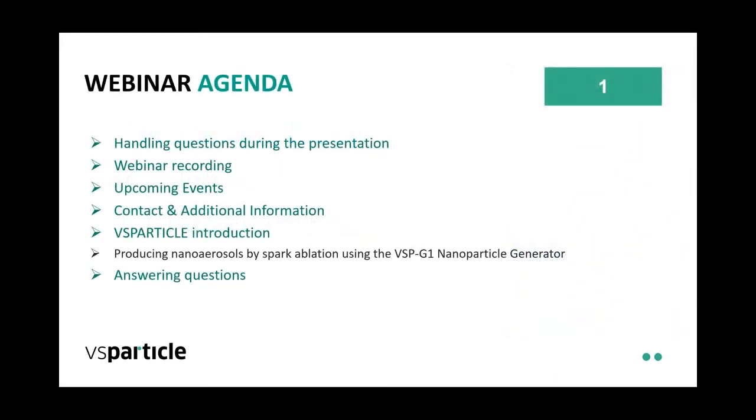We will discuss handling questions during the presentation, webinar recording, and upcoming events. I will then give you a few ways in which you can get in contact with us and request additional information, and a short introduction into VS Particle for people who are not yet familiar with what we do, before we dive deep into Pfeiffer's presentation, producing nanoaerosols by spark ablation using the VSP G1 Nanoparticle Generator.